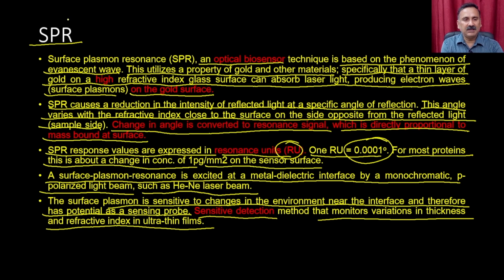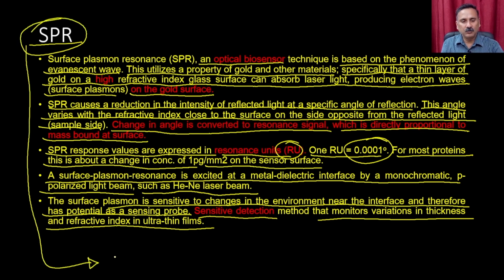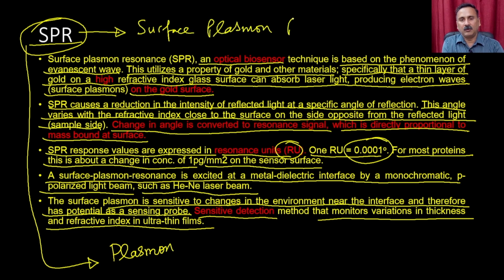So what you see here is that SPR relies on two things. As the name suggests, what is SPR? It's called surface plasmon resonance.